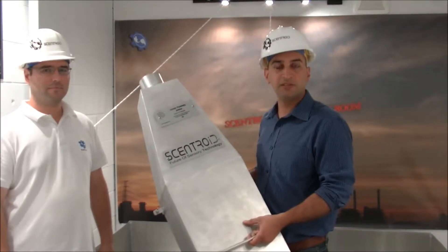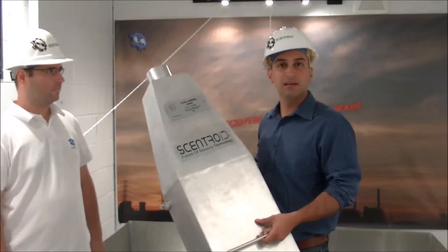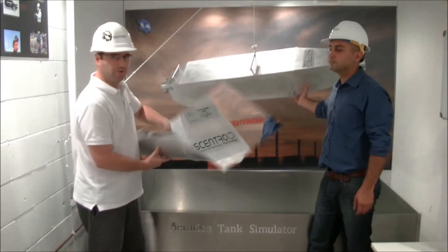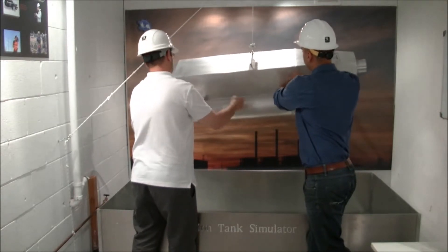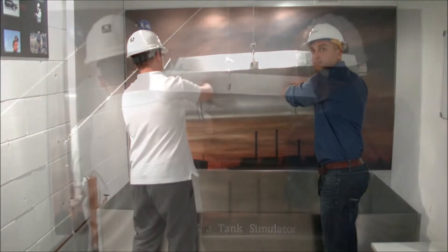For a solid surface you don't need to install the pontoons and you just use it as is, but now we're going to install the pontoons to use it on our holding tank in the simulation. It's very easy to install the pontoons — we just push them in and tighten the wing nuts.